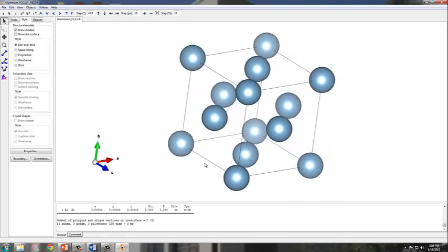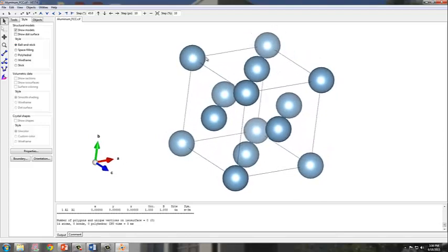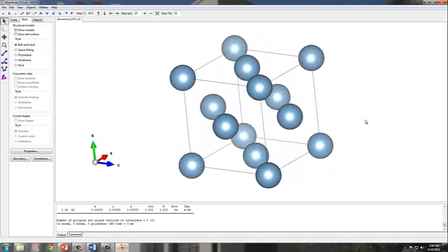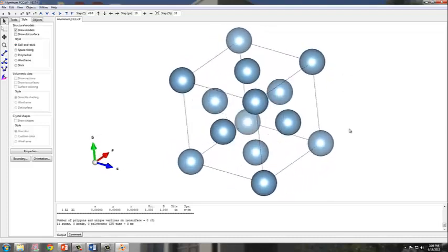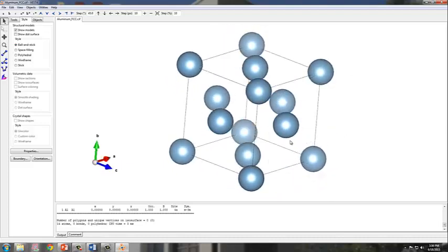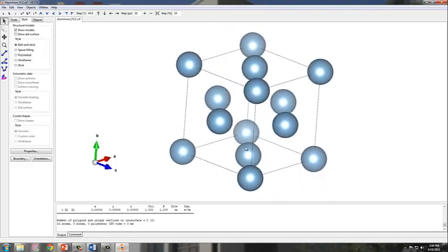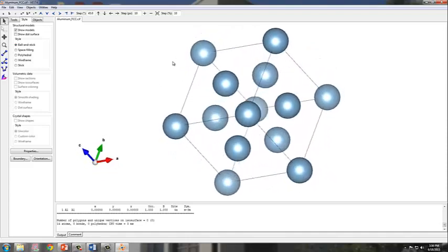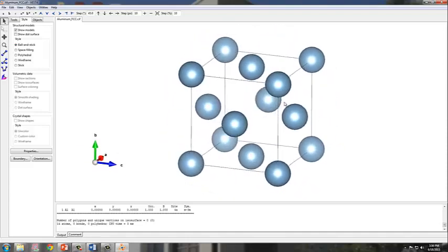You can actually see that this is face-centered aluminum. We have eight corner atoms and also six atoms which are located on the face. What I'm actually doing now is holding the left click and freely moving and rotating the model.